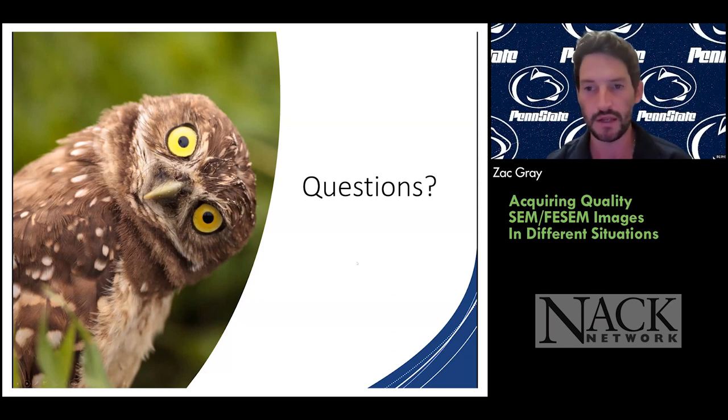I know Renee had answered this one. A couple of a little more technical questions also. So Bangzhi, you just went through those three optimization parameters with the stigmation and the wobble. Does the order that you do those in matter, or does it not matter? Do you have to always do the stigmation first, or is there a certain order that makes it easier for the user?